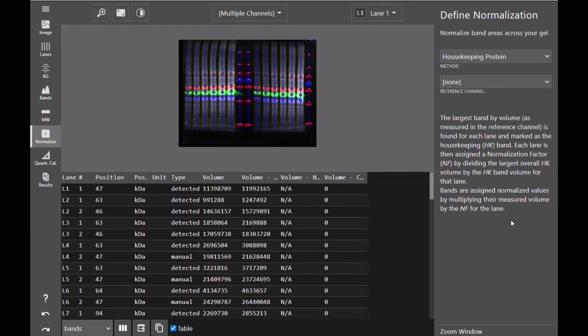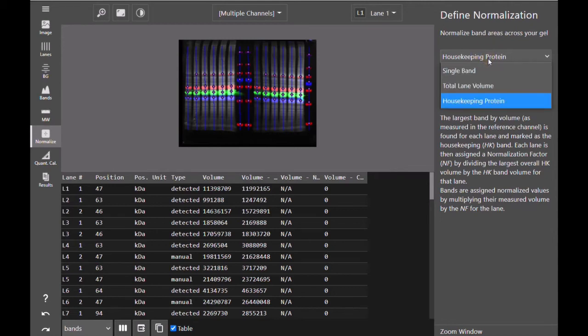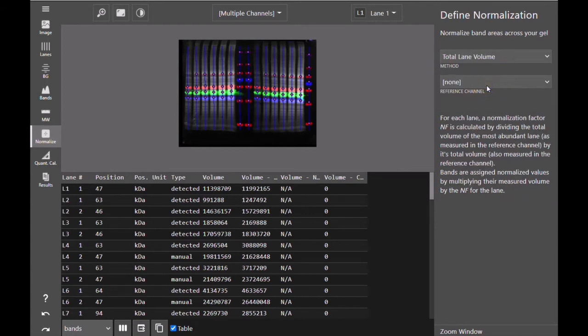The volumes for all other bands in the lane are multiplied by the normalization factor for that lane in order to determine the normalized volume. For this image, we have a total protein stain and so we will be using total lane volume for our normalization.